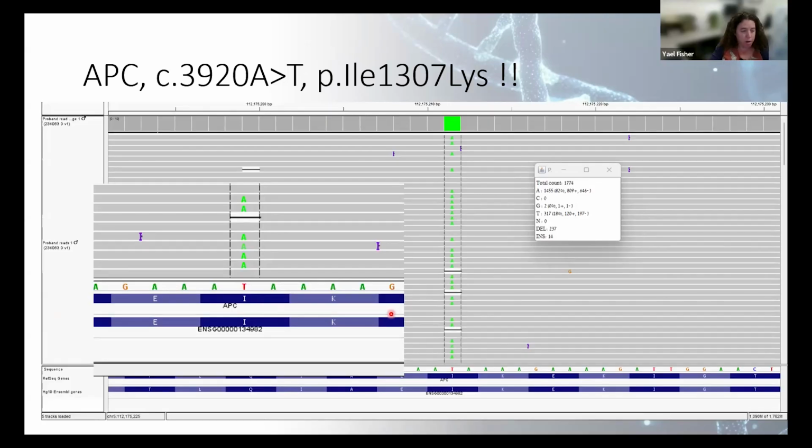Just like we saw before. So in some of these reads, the sequencer missed some of the A's. And because the T here was absent, it was read as a deletion of the T, while in fact it should have been read as a missense variant in this position.